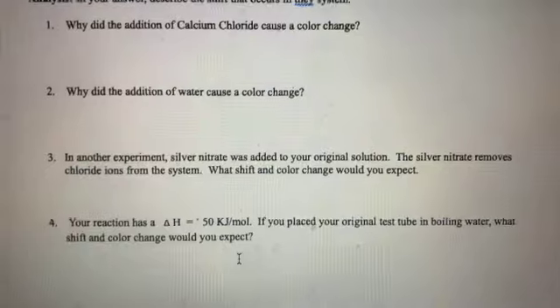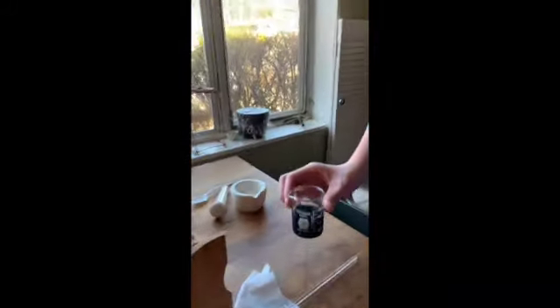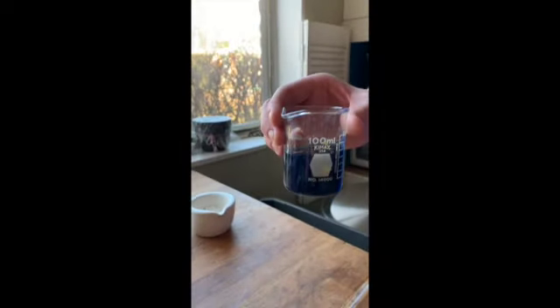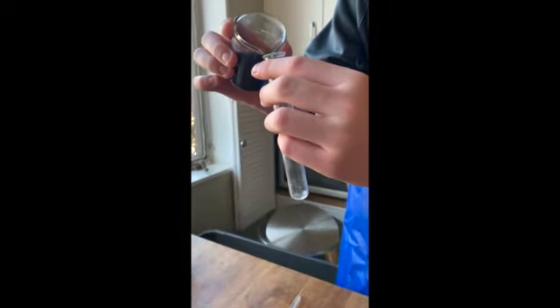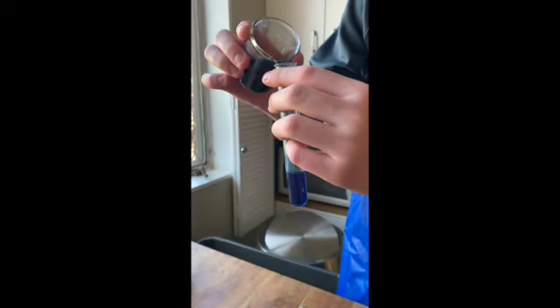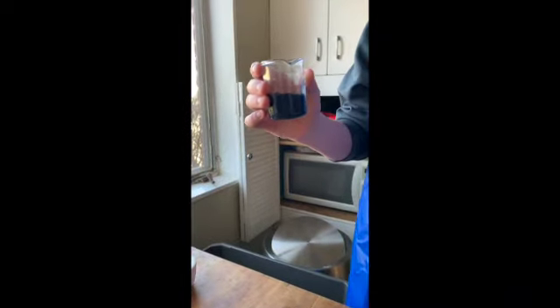So enjoy the lab and have a great day. Welcome to our lab — here is our reaction at equilibrium. It's a deep purple color. Maurice is just going to put some of our equilibrium reaction into two test tubes so you can see the color. It is a very very deep, deep purple, deep bluish almost.